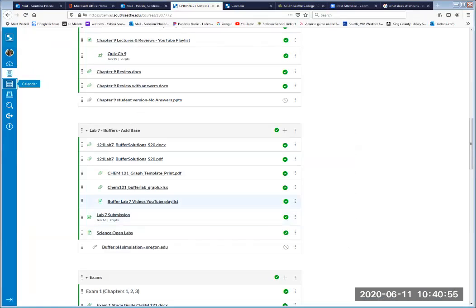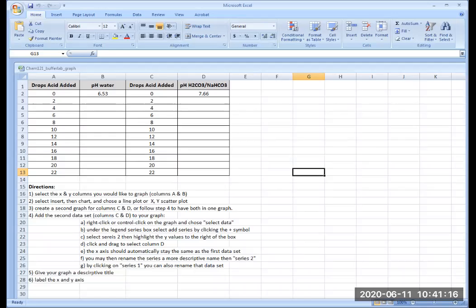If you want to use the Excel graph and you are at ease typing the values of pH in the Excel graph, then you would use this one, the XLSX file. So let me show you what it looks like on Excel. Here I'm sharing the Excel file.